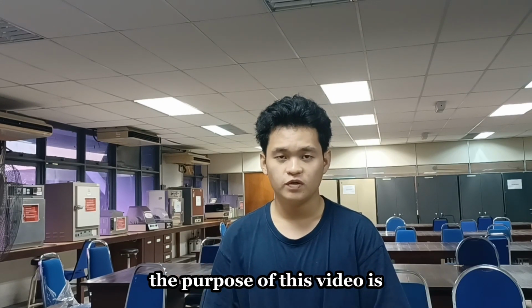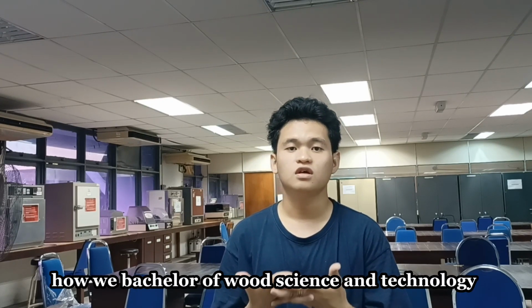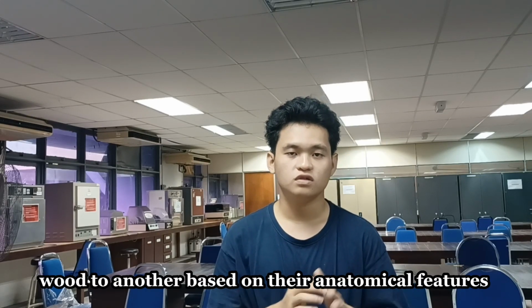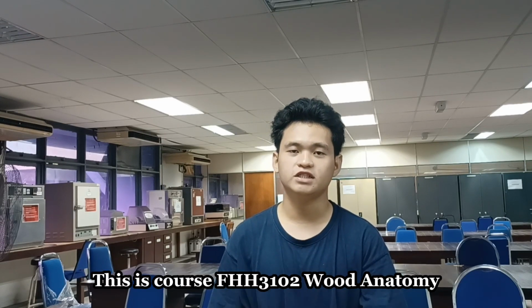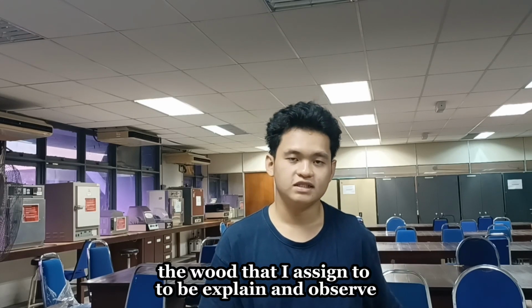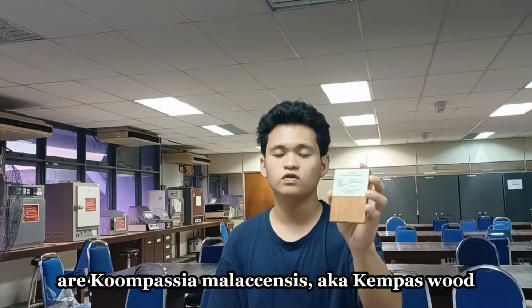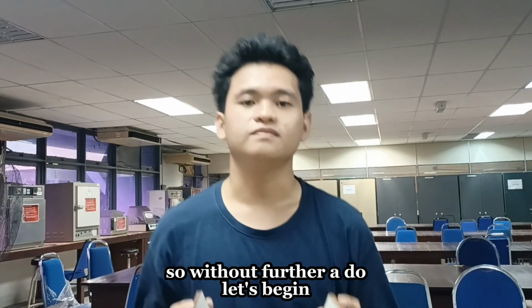The purpose of this video is to explain and demonstrate how we, Bachelors of Wood Science and Technology, observe and differentiate one species of wood from another based on their anatomical features. This is course FHH3102 Wood Anatomy by lecturer Dr. Amir Afan Abdul Azim. The woods I was assigned to explain and observe are Koompassia malaccensis, also known as kempas wood, and Intsia palembanica, also known as merbau wood. So without further ado, let's begin.